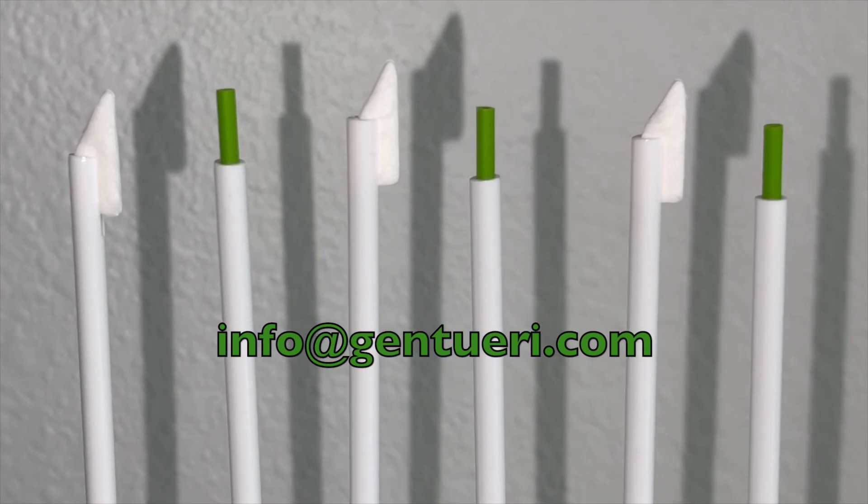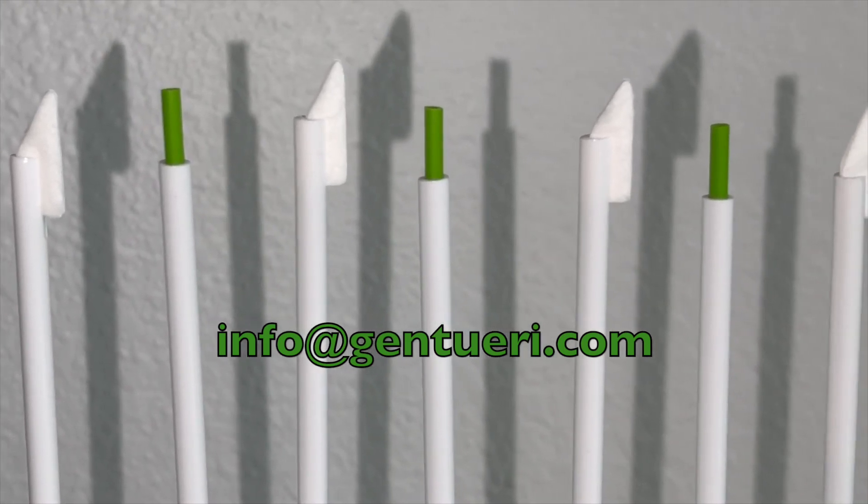Email info@gentueri.com to request a sample today.